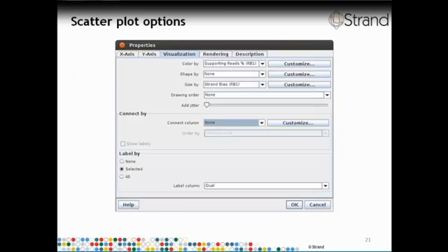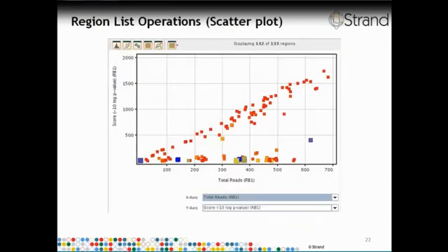The Genome Browser has powerful tooltip support. So by placing a mouse on any individual base on any read, we get complete information at the base level and at the read level. Sometimes it's a little bit hard to get an overall perspective in the Genome Browser, especially when the coverage is very high. In this particular case, the coverage is closer to 450. So scrolling through the reads is not going to be an easy operation.